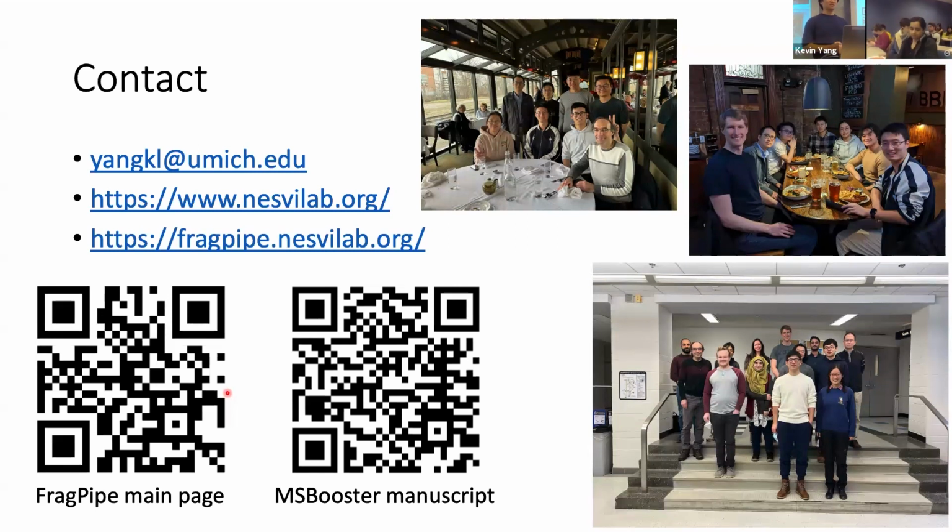They know what the peptide is and know what the spectra is, and they're trying to predict the peptides from the spectra.